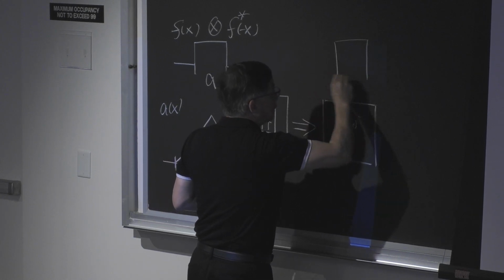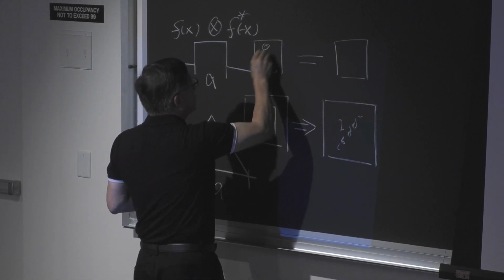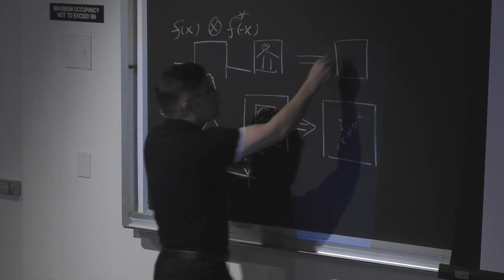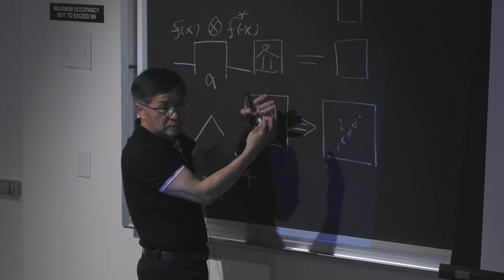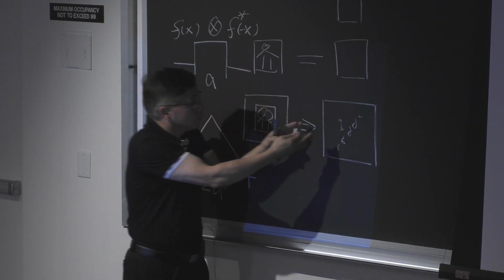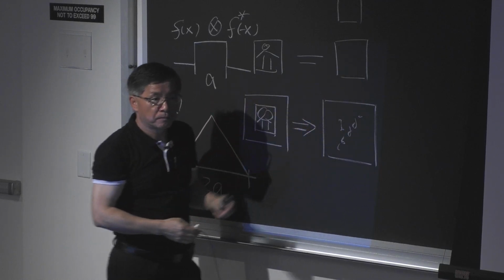less, the same diffraction pattern, but sampled less, you will get this. Okay, you will not get the zeros. So you only sample coarsely. If you sample even less, you get an aliasing problem. You get overlap. So here it's exactly making sure there's no aliasing, which means you have to sample finely. It's no free lunch.